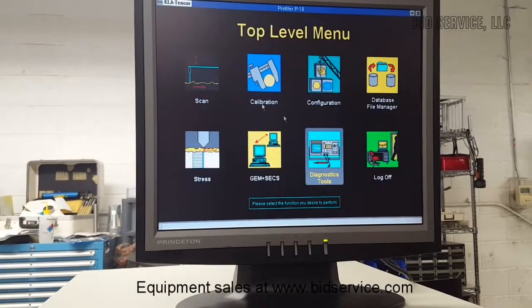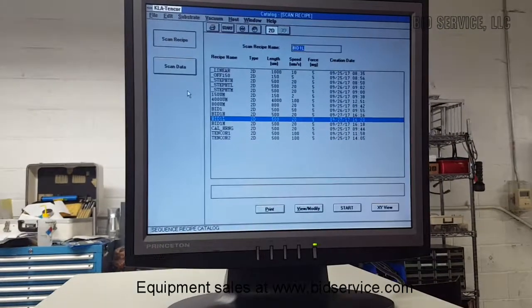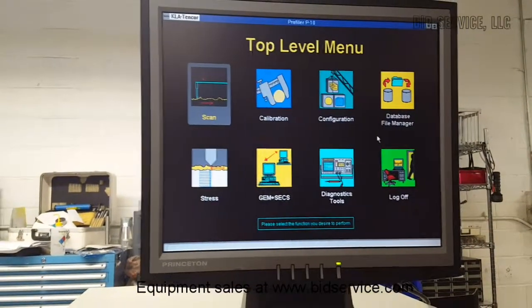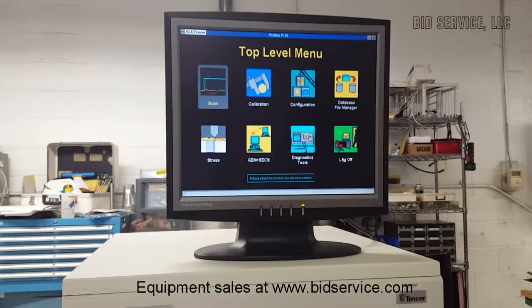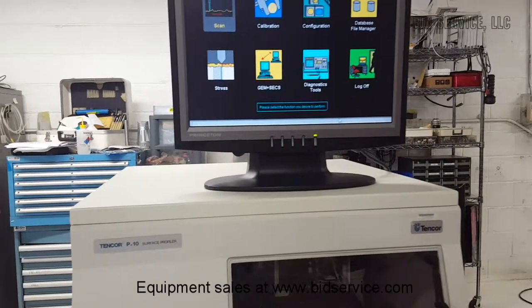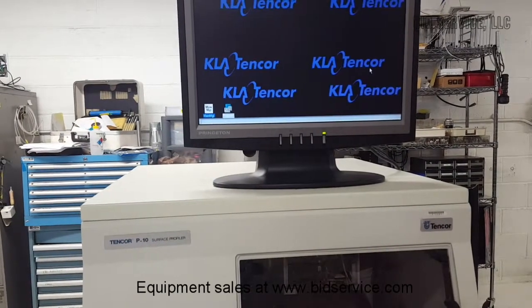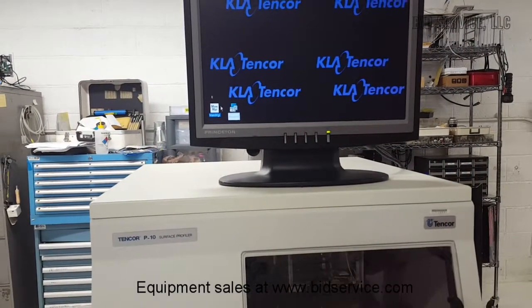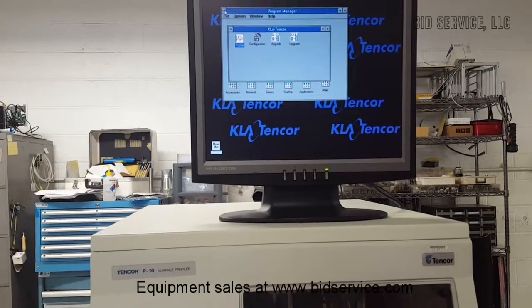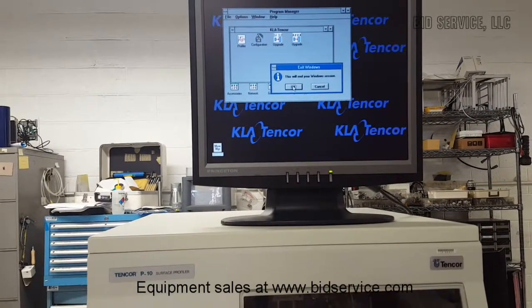And there are various features available on this machine other than these screens here. So I'm going to also show one more thing. In order to log out of the screen, press the shift button and then use the mouse. It is a 9-pin serial port mouse, and click on log off, and that will exit this screen. So in order to log in back again, I'm going to completely log out of the Windows session.